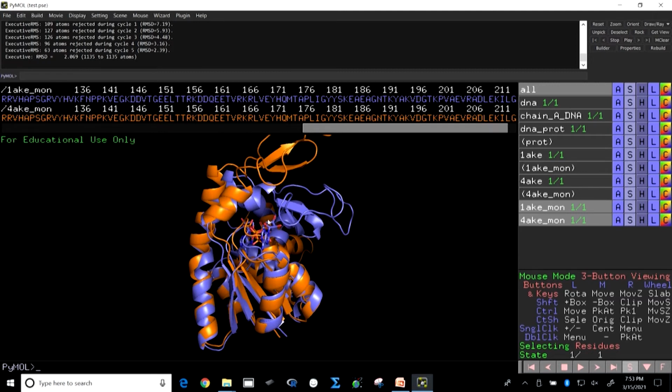Kinases, if you check the literature, are enzymes which go through a huge conformational change. They have a big loop called the P loop, and this P loop changes its conformation, open to close, close to open, and this is how a protein declares its state of work.